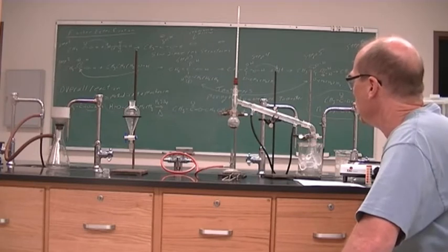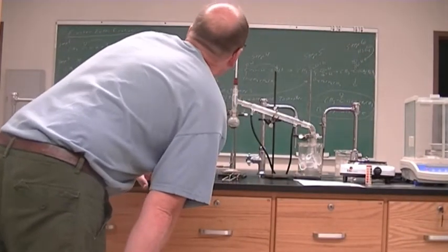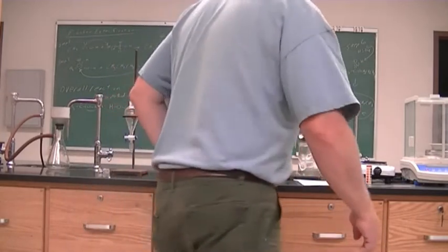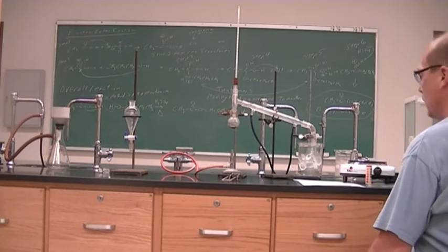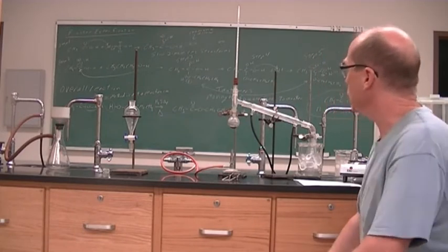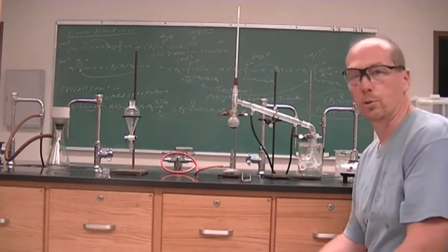It's getting thicker and thicker with heating. All right, now we are at 120. So at 120, we're going to call it good. We're going to stop the distillation at 120 degrees Celsius. Again, if our yield isn't ideal, it doesn't matter. We're just looking to get some product, and we're not looking for 100% yield.